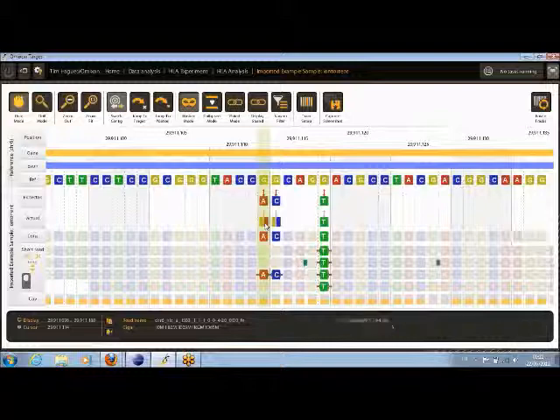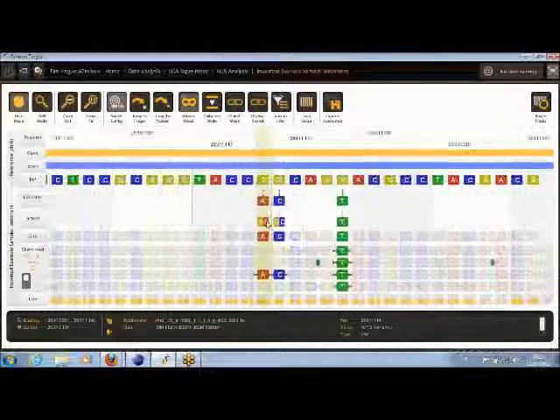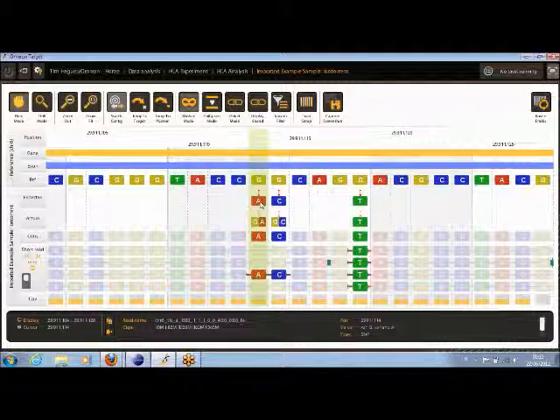As we zoom in over here, we can see that on the actual variant track over here, it looks like we have a heterozygous mutation here. The reference value is G. We're expecting an A variant in here, and we have actually found a heterozygous GA variation in here.